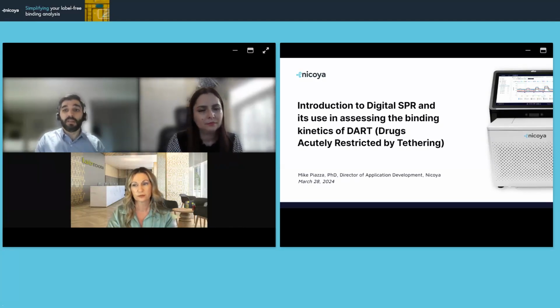Now, in the opposite orientation, where the ligand itself was of a low molecular weight, then that opens up the door to allowing us to measure smaller molecules, because the analyte will be larger and we can detect a larger binding response. But in the analyte method, I would say about 1 to 1.5 kilodalton would probably be the lower limit that I would want to work with.